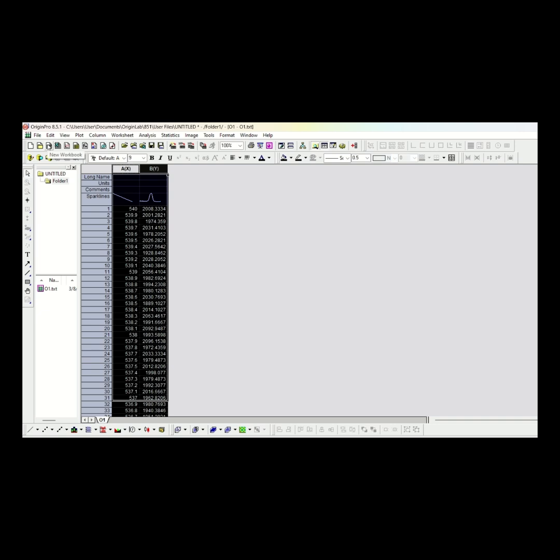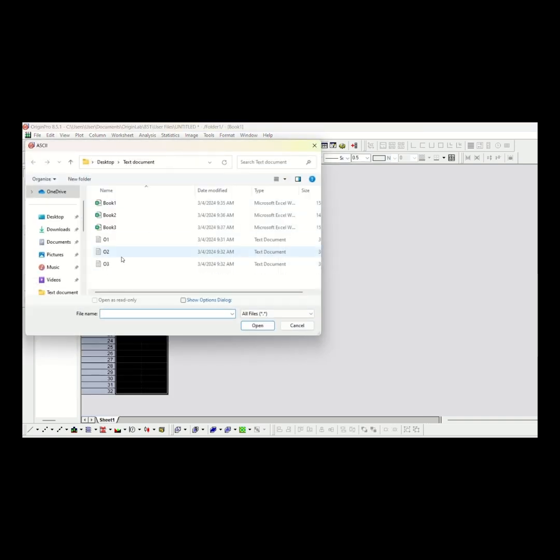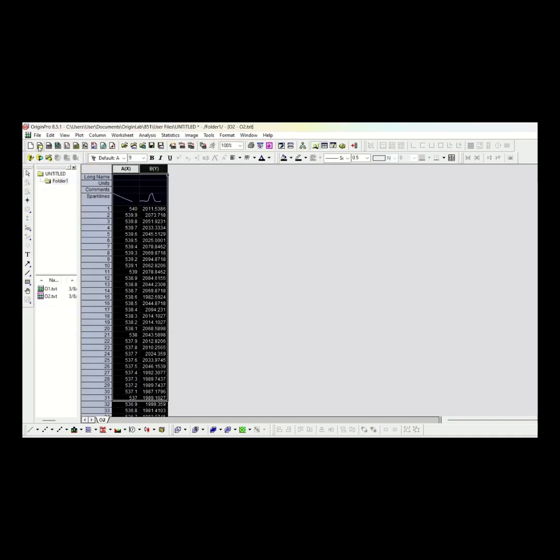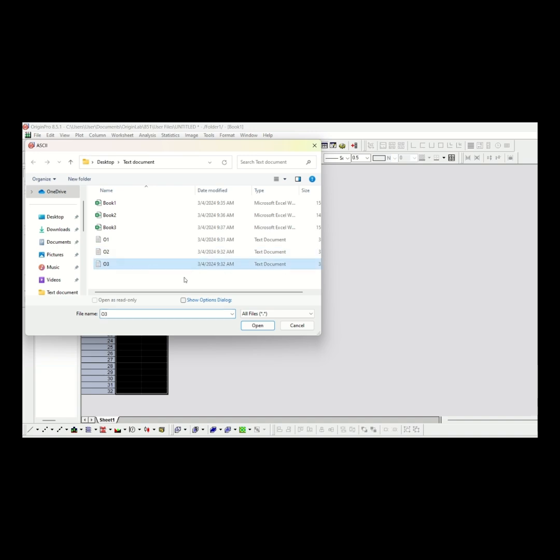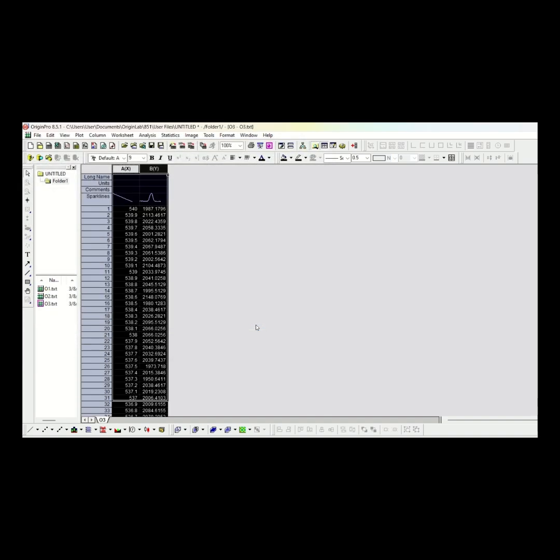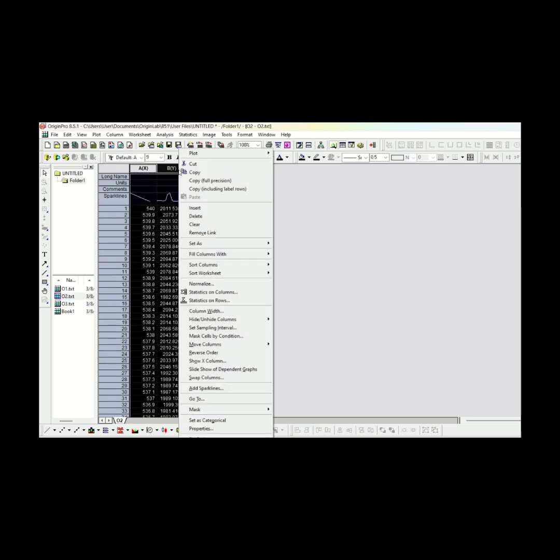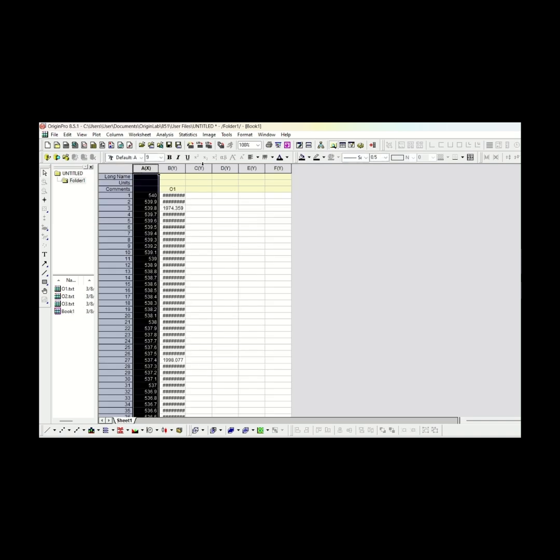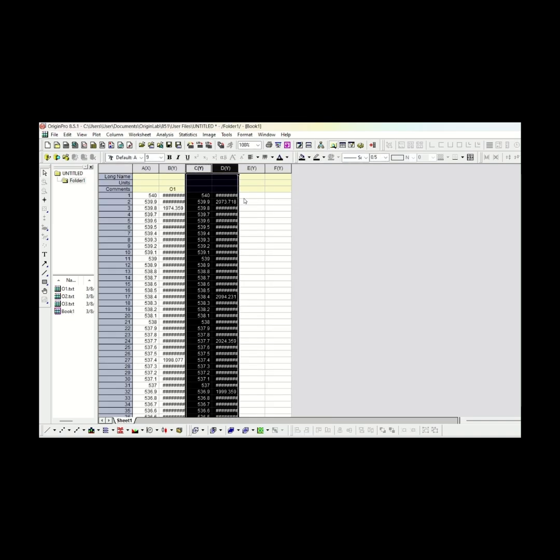Similarly, you can copy all your data into the workbook. Here I am taking three kinds of data to stack, that is O1, O2 and O3. So I copy O2 into a new workbook. Similarly, I copy O3 into a new workbook. Then add four more columns to the new workbook and copy the second data to the new workbook. And you can name the second data O2.